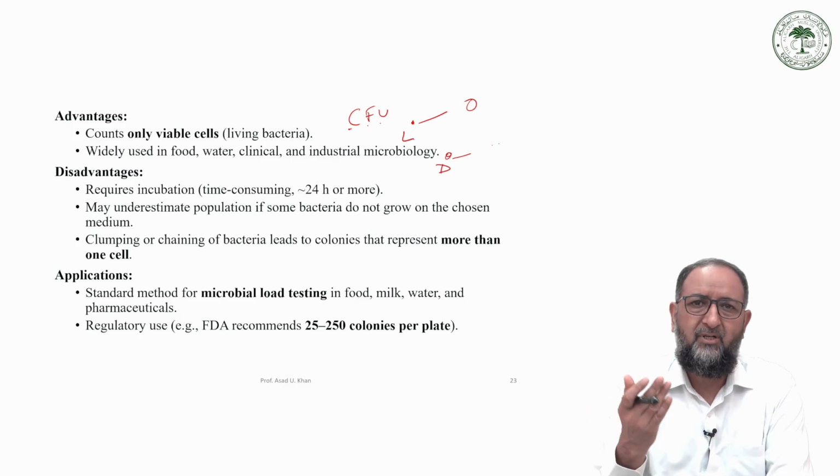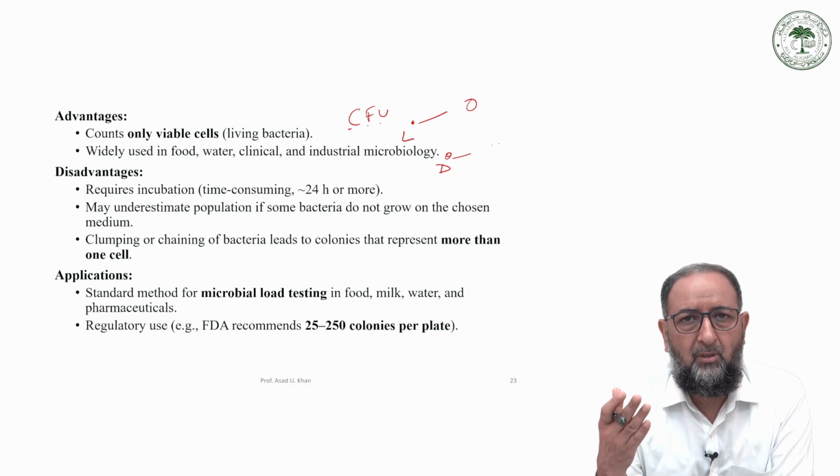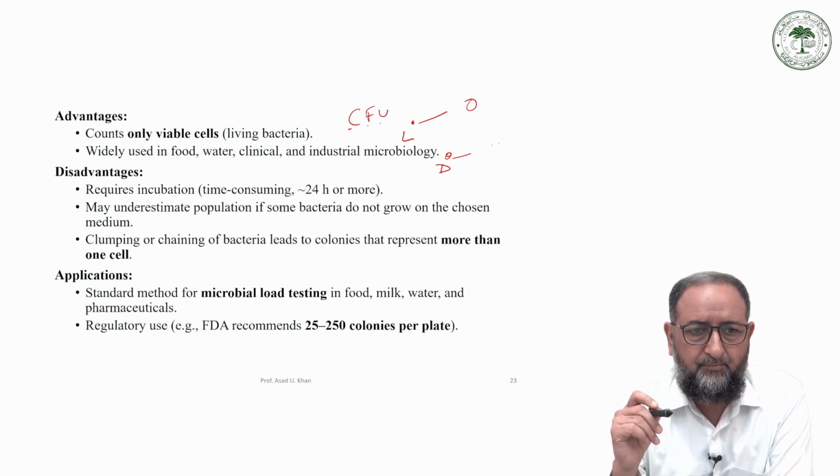So definitely 2 different, 3 different, 4 different types of cells may not grow or have optimized the same conditions. They may have varying conditions. All right. So this could be one of the demerits of this method.